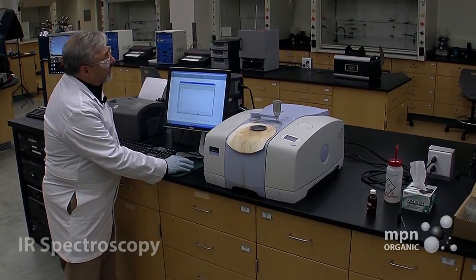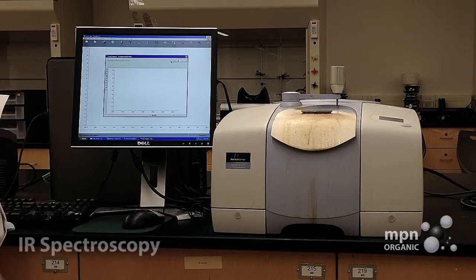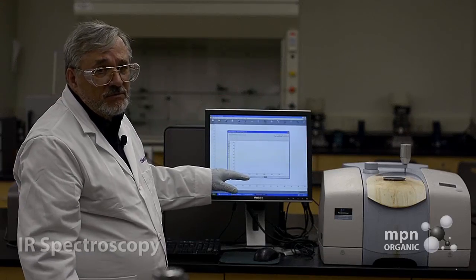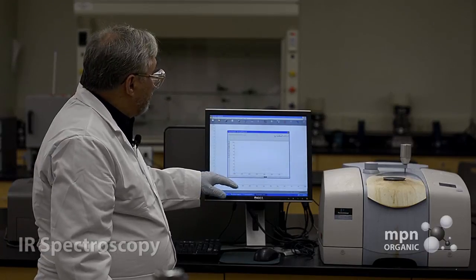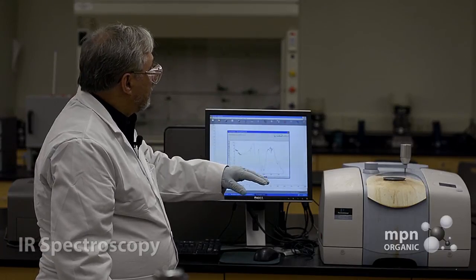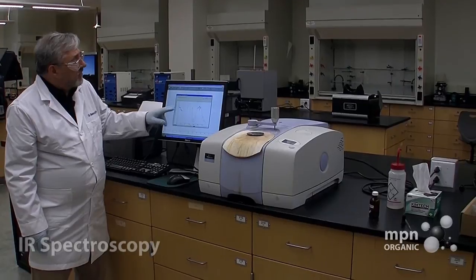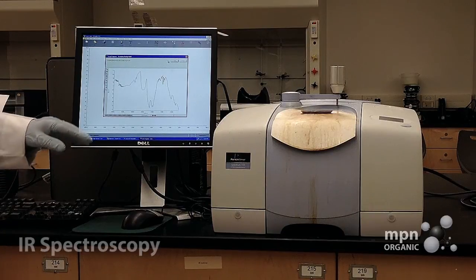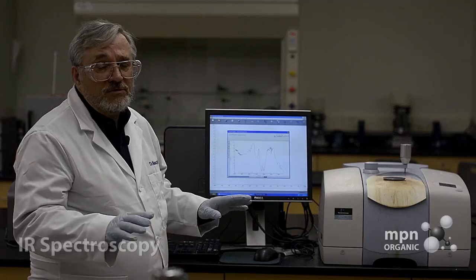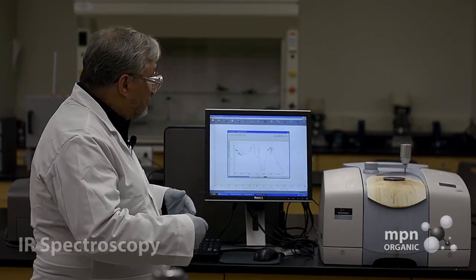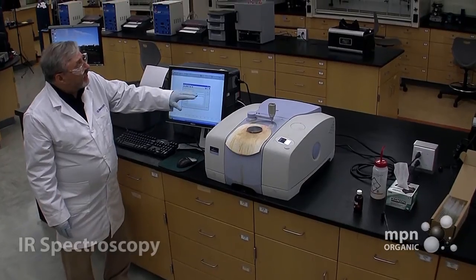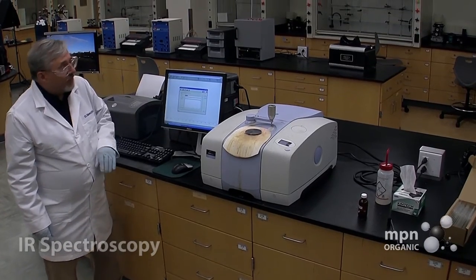So we're going to click that. We're going to come to this particular window and then hit scan. Now, it's going to take four pulses of the infrared spectrometer. You can see what the background looks like here. It's quite intense, actually. And you're going to go through four scans. Don't do anything. Let it proceed through four scans.